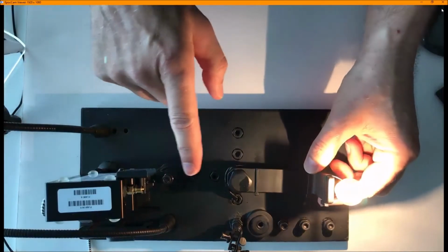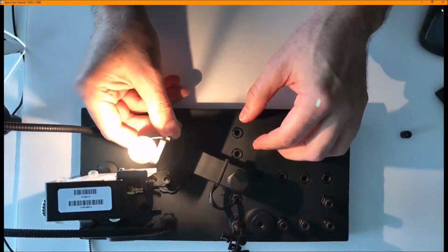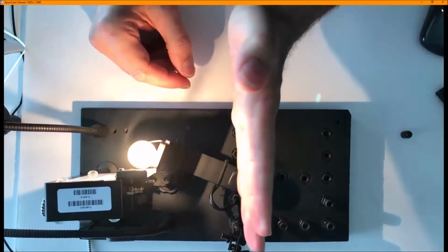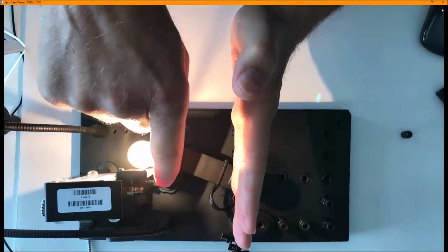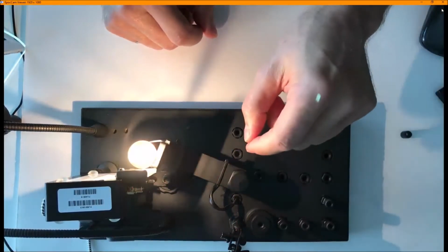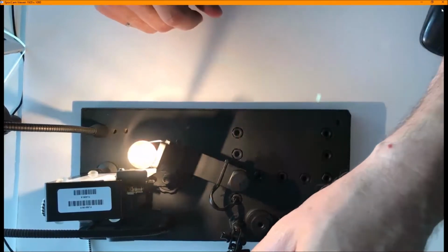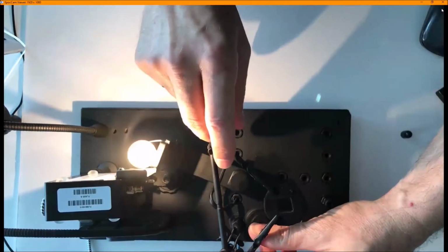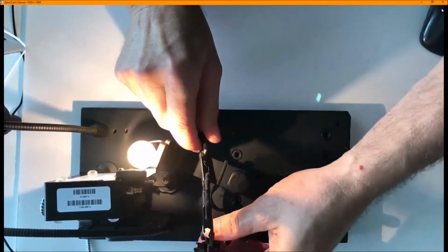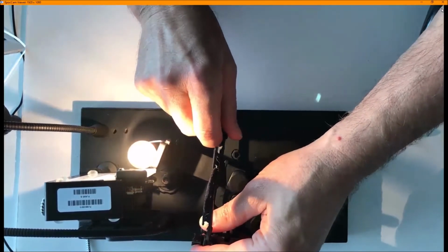To measure reflections, we're going to put this light on the side of the spectrometer in a position where it can reflect on surfaces towards the spectrometer. And to make sure we position items always in the same place, we're going to use a small disc that I've constructed so that we're always aligned towards the spectrometer the same way.